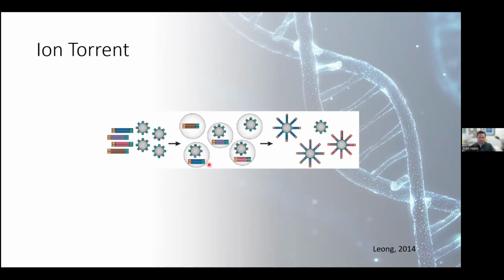And this is an oil immersion, so tiny, tiny droplets, which have polymerases, dNTPs, template DNA, and our bead. You need a single fragment per droplet, which is why the emulsion process is so necessary. If not, you'll have polyclonal amplifications that will have mixed sequencing results.